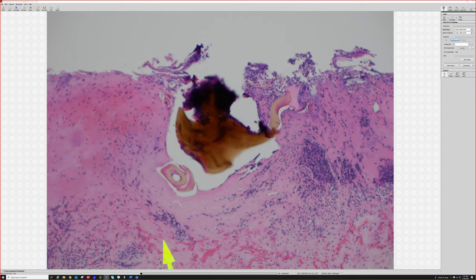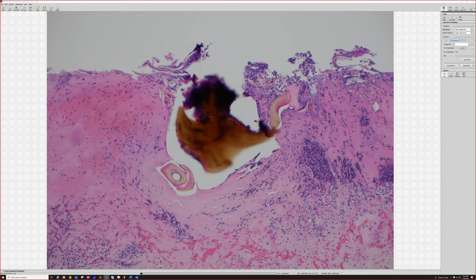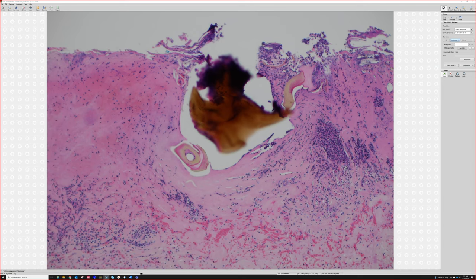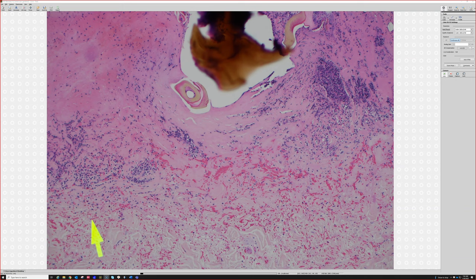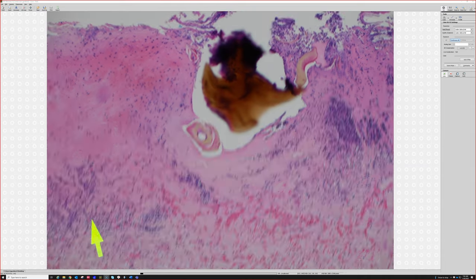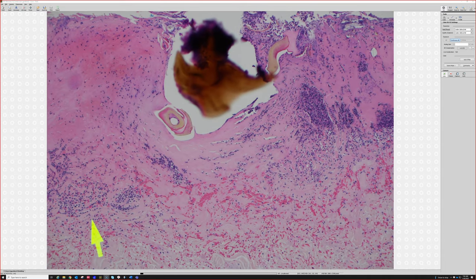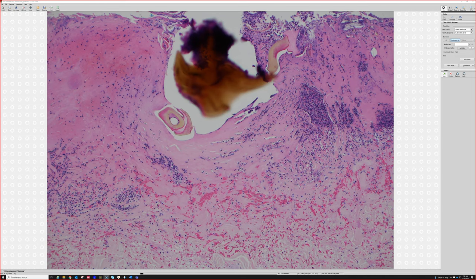Back to the arthropod mouthpart — usually when there's a chunk stuck in the skin, it's going to end up being a tick mouthpart. Ticks have this unique thing where the dermis right around the mouthpart gets really homogenous, smudgy pink stuff that looks like a mixture between fibrin or sclerotic collagen. My understanding is this is a cement-like material created by the saliva of the tick that helps seal the mouthpart in there. So when I see a bug bite that's got an ulcer with this dense smudgy pink stuff, I tend to cut deeper to see if I can find a tick mouthpart.